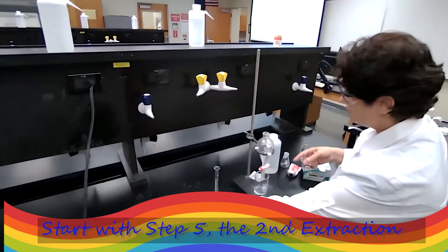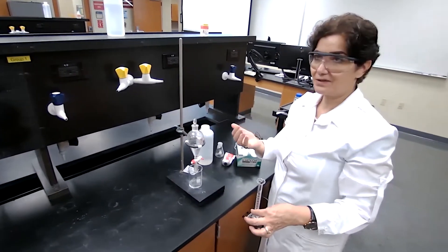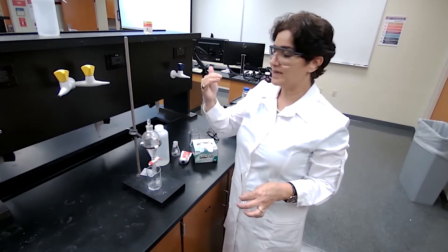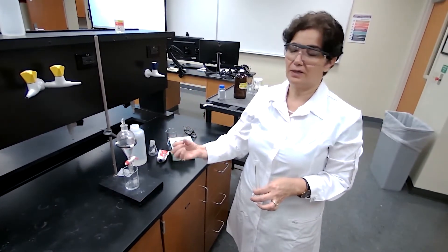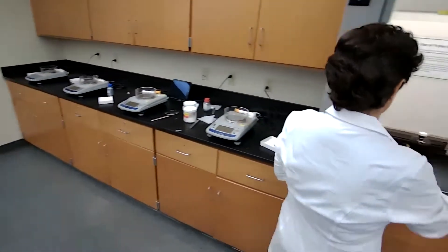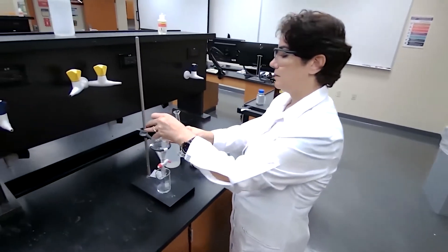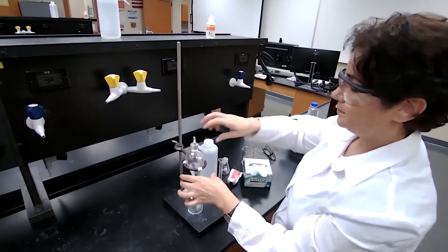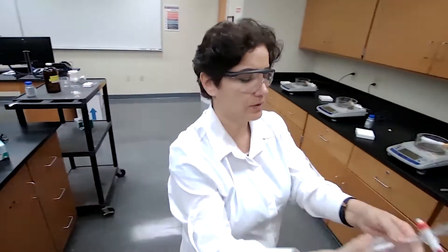One extraction is not going to be effective for separation — we have to do successive extractions. With successive extractions, you are using the same extracting solvent multiple times. Each time you will get some of the organic acid into the aqueous layer. I'm going to measure another 10 milliliters of sodium hydroxide and bring it back to mix with the ether layer, then shake it and vent it into the fume hood.